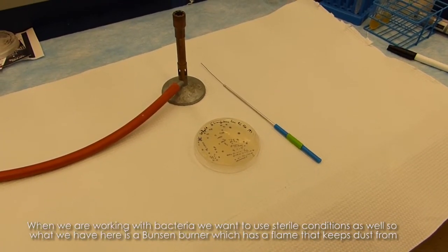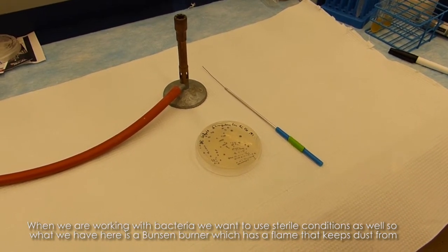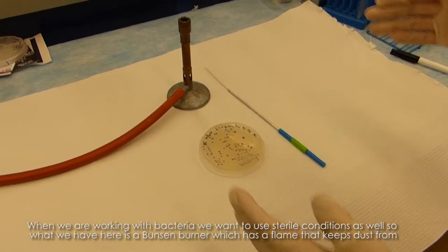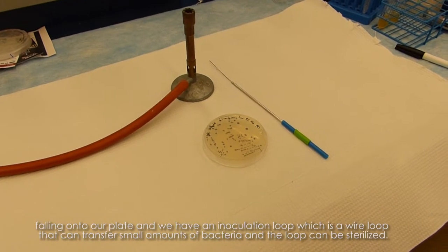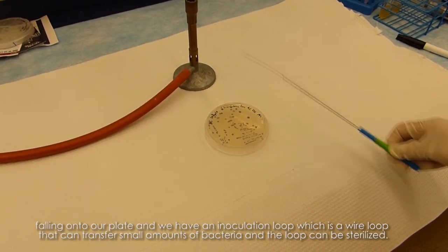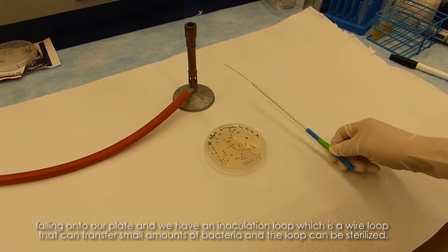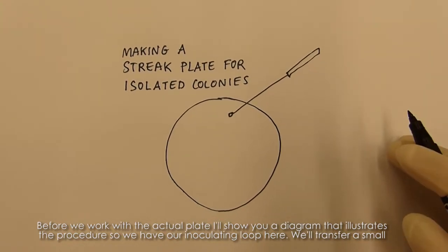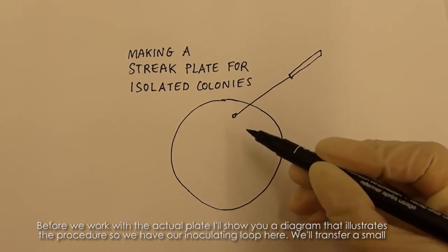When working with bacteria, we'll want to use sterile conditions. We have a Bunsen burner here, which has a flame that keeps dust from falling onto our plate. We also have an inoculating loop, which is a wire loop that can transfer small amounts of bacteria and can be sterilized. Before we work with the actual plate, I'll show you a diagram that illustrates the procedure.